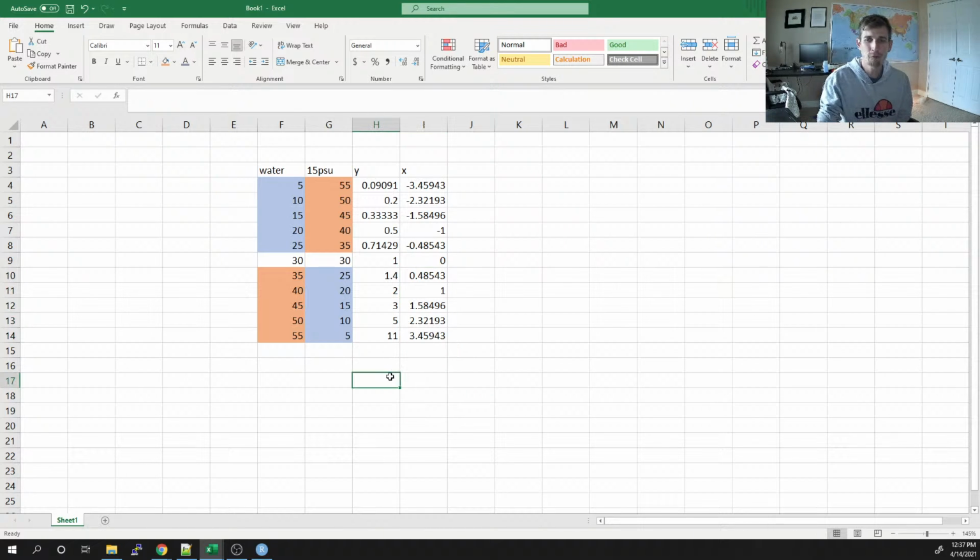And so if we kind of remember what these values are, this is kind of like a pseudo normalization. But whenever we take the log 2 of a ratio, it tells us the direction and intensity of that change, right? So it's saying that compared to salt water, water is lower expressed because there's a negative log fold change. The genes here, in these cases, in water are lower.